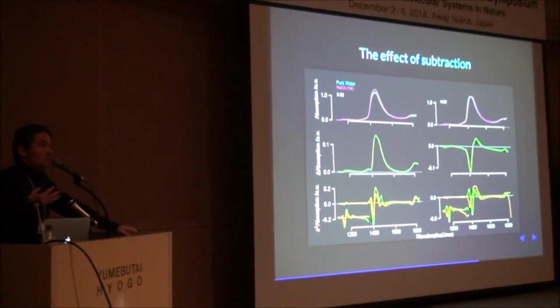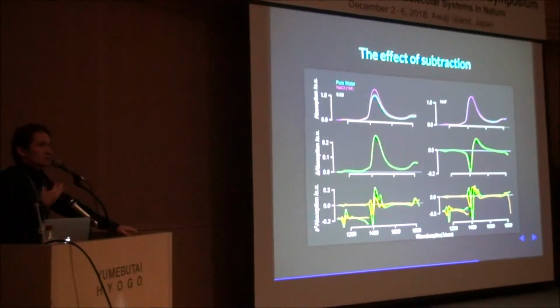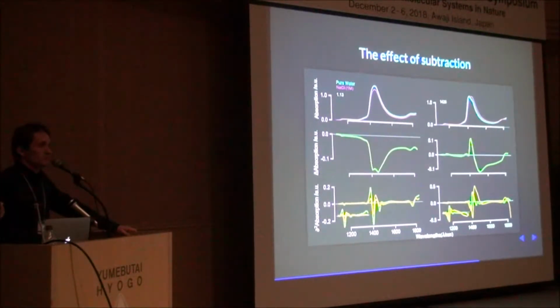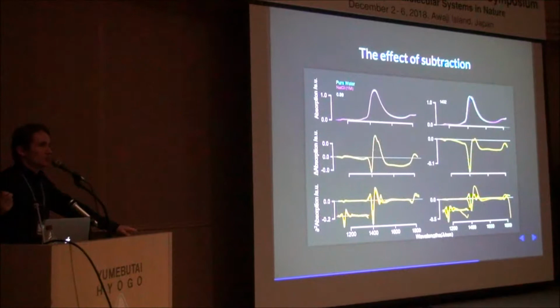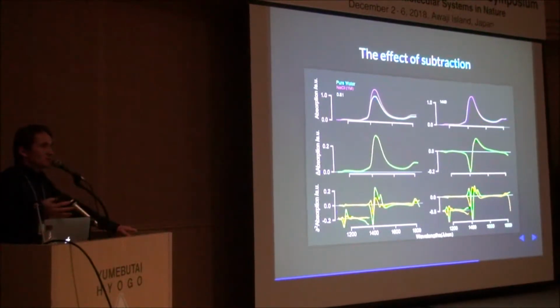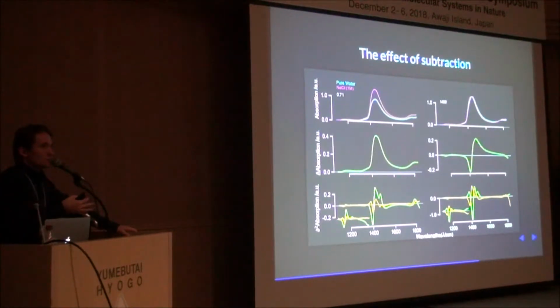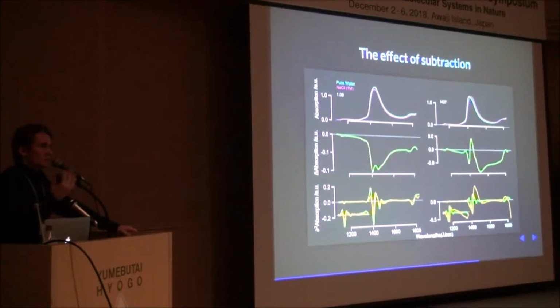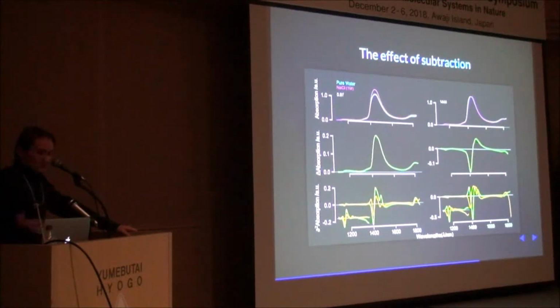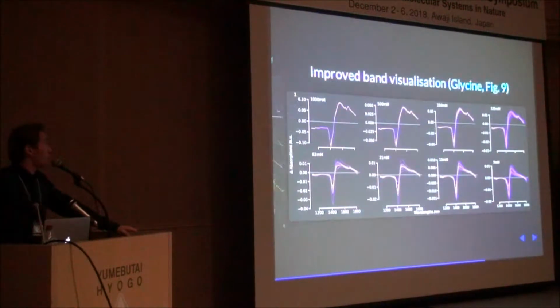When you do such an operation, you have the difference, and you have both spectra, the water and the raw sample spectra that you started with, so you don't lose any information. You can analyze the difference spectra, you can analyze the water that you have subtracted, you can analyze all three of them. You can just concatenate them together and then put them in PCA.